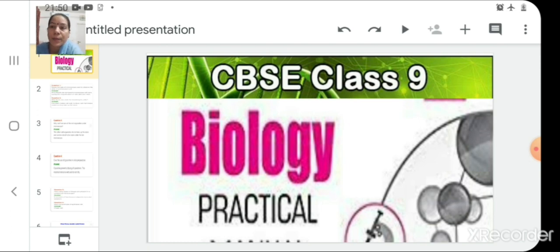In our previous session we studied one of the practicals, in which we studied the plant cell, where the sample was taken from onion peel. We studied the various procedures, precautions, observation, inference, etc. And in today's session, we are going to discuss some of the questions related to that practical.